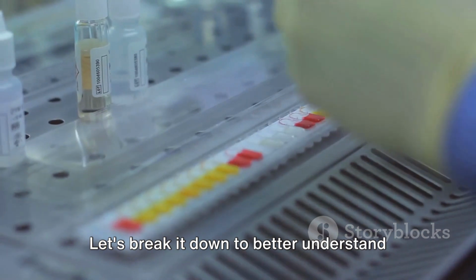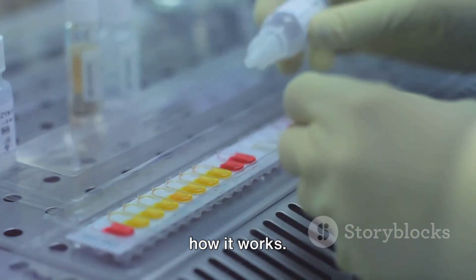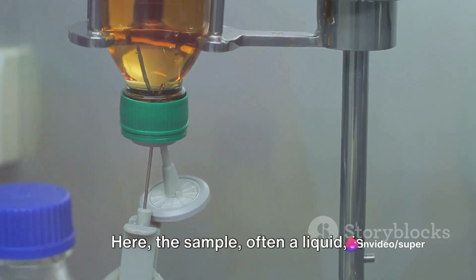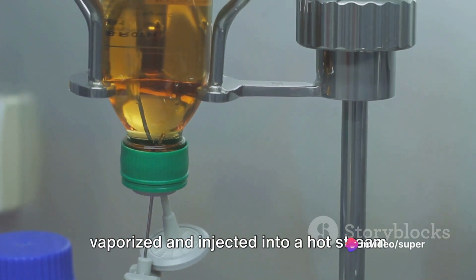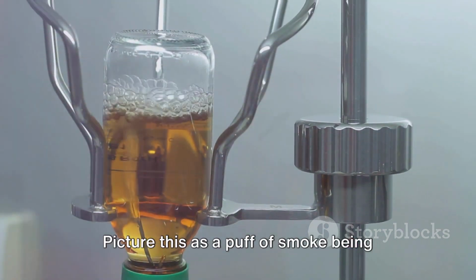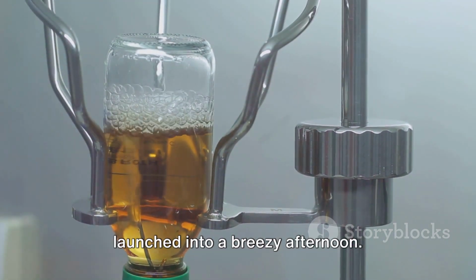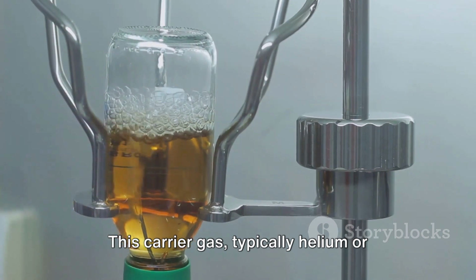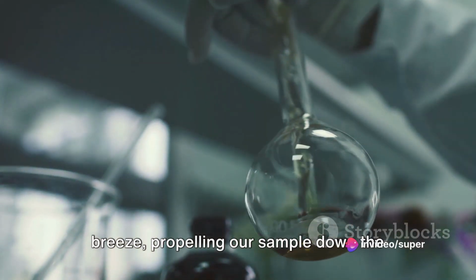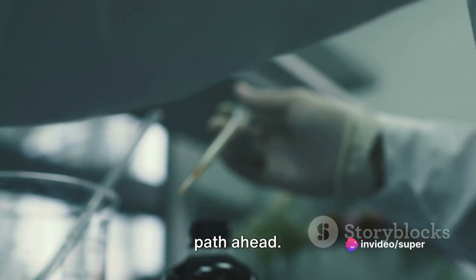Gas chromatography operates in a three-step process. Let's break it down to better understand how it works. First, we have the injection. Here, the sample, often a liquid, is vaporized and injected into a hot stream of carrier gas. Picture this as a puff of smoke being launched into a breezy afternoon. This carrier gas, typically helium or nitrogen, is similar to our afternoon breeze, propelling our sample down the path ahead.